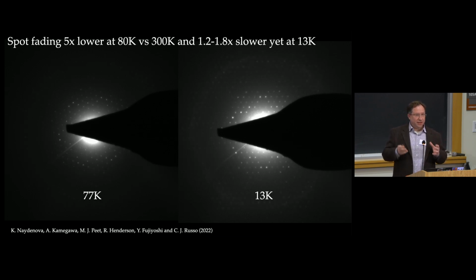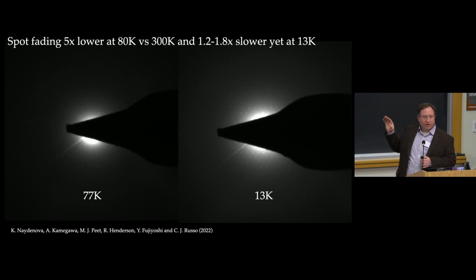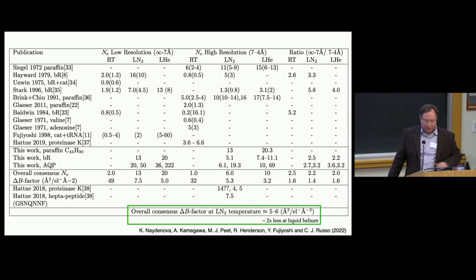And I think it's a hand-wavy explanation, but you wouldn't go too far wrong in thinking about all of the benefits we get from cryo-EM coming from the fact that we're actually caging and trapping and stopping these intermediates from going any further and causing any further trouble. So there's a long history in this field of trying to understand this.